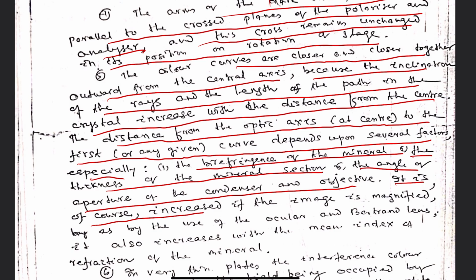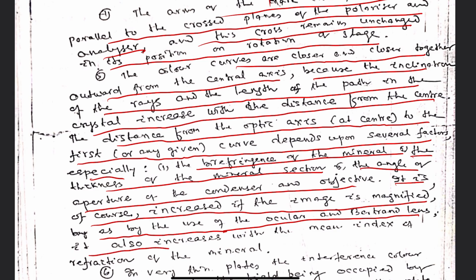It is of course increased if the image is magnified, as by the use of ocular and Bertrand lens. It also increases with the mean index of refraction of the mineral.